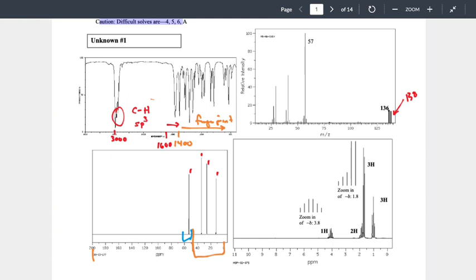Right? And then there were 4 things that were important for NMR. We just addressed 2 of them for our carbon NMR. And if we look at our worksheet, there's no other space to write anything for carbon NMR, because the last 2 things, due to limitations of the instrument, or really the abundance of the nuclei for carbon, we don't look at very often.